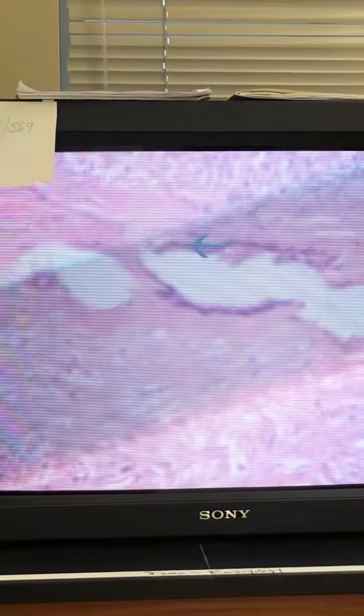Okay, so what else was on your list? Who has their list? Dorsal horn, is that just the fatter part, the upper fatter part? I know you can't say upper because you could switch it. But I think this is the dorsal horn up here, and it's a little bit skinnier than this down here, which is sort of rounded. So this is the ventral, and then this would be the dorsal. And I'm not going to switch them around. So the upper is going to be dorsal.